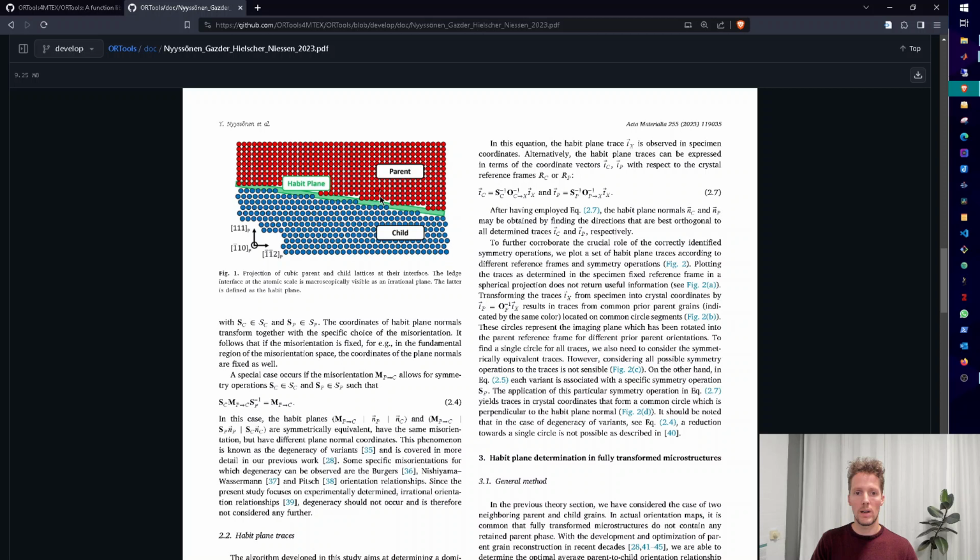in the parent phase. But what also happens is that, due to the accommodation strain of, let's say, the different volume and the shears involved in the phase transformation, we get some curvature into this macroscopic interface. Atomistically, we have ledges of very nicely arranged interfaces with a low energy configuration. But macroscopically, those ledges, those terraces of different atoms, show up in a macroscopically visible interface that is different from this perfect crystallographic interface. This green line indicates the habit plane.